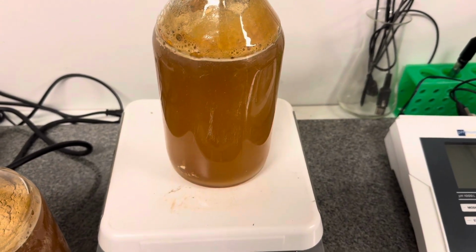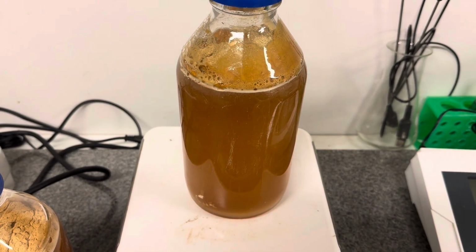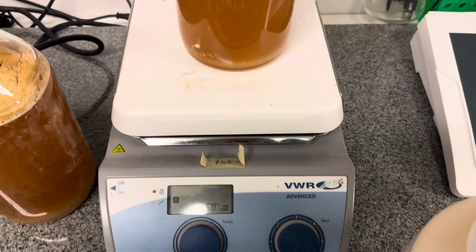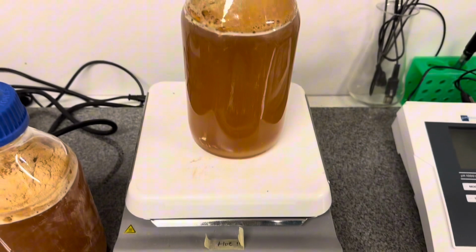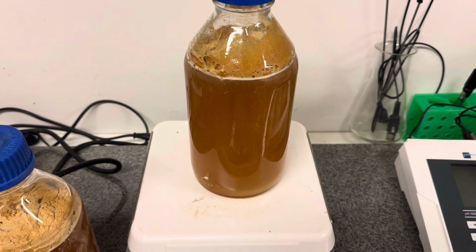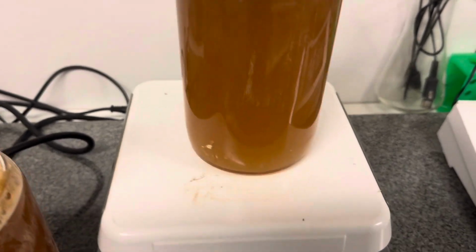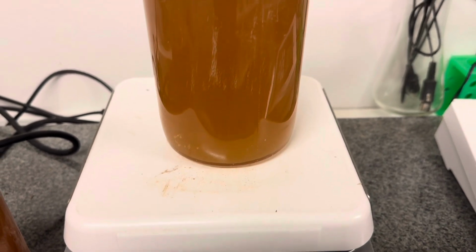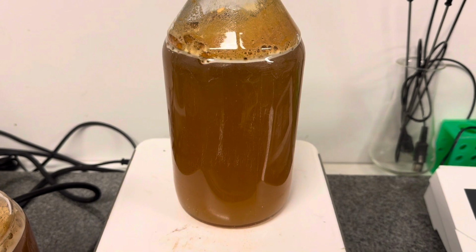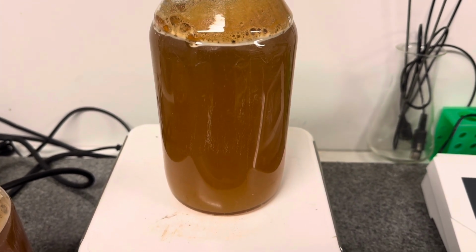Okay, now I have filled these bottles with water, but this water is not tap water, it is distilled water. So now let's start the machine, and you will see that the water will show some movement. You can see that it is moving the magnetic bar inside this bottle, so that the dissolution of agar and malt extract could be made uniform.